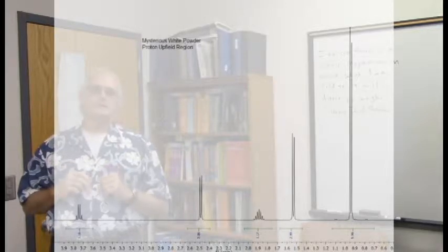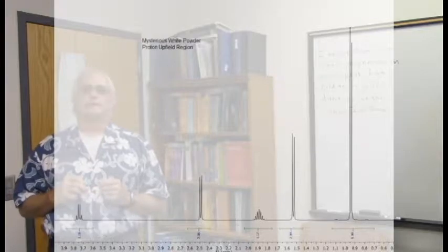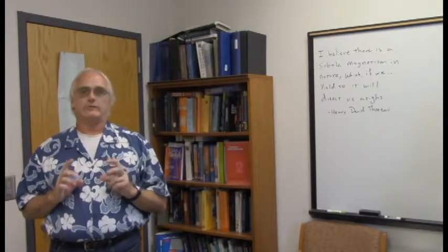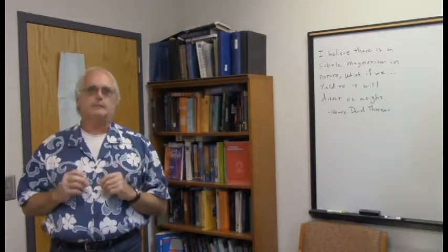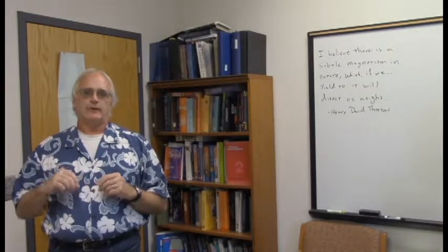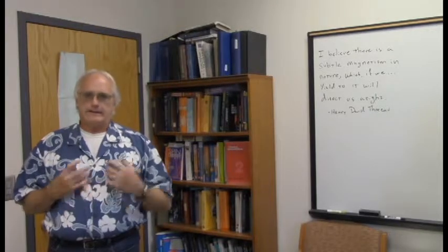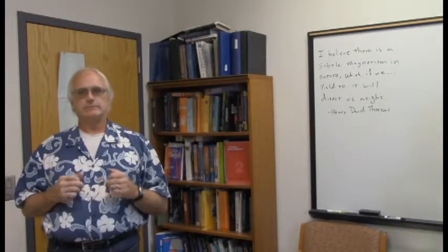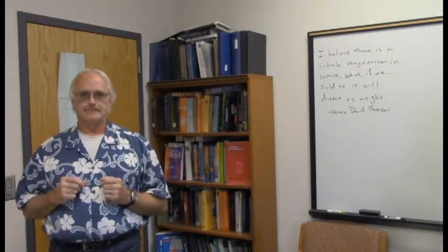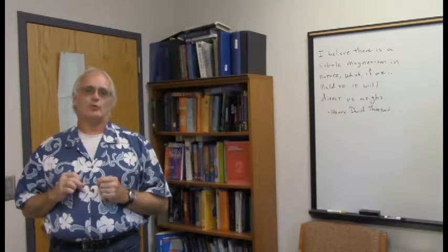But what I want to really introduce you to here is using the COSY spectra and ultimately the HSQC. These spectra tend to take a little bit of getting used to for students, especially COSY. This is a classic example of how a COSY spectrum can really tell you a lot of information in an example molecule that is not hugely difficult, not too terribly simple either. And so the COSY spectrum is the one we're going to spend quite a bit of quality time on.